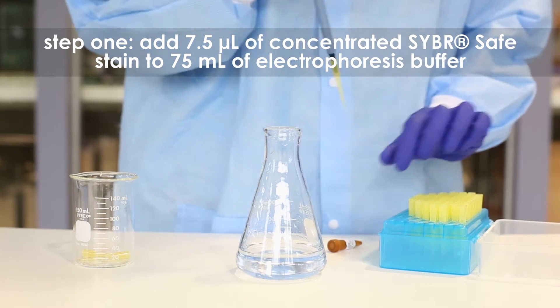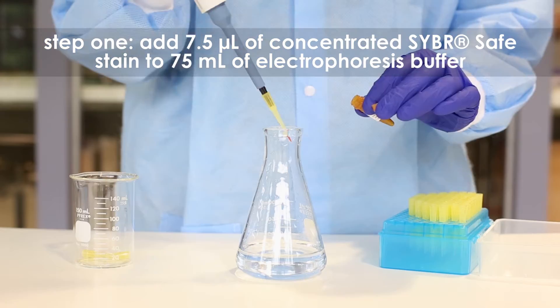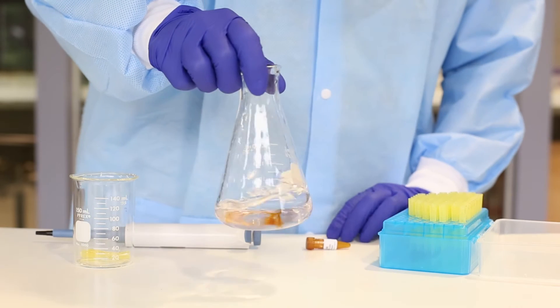Step 1. Dilute the CyberSafe Stain by adding 7.5 microliters of the concentrated stain to 75 ml of electrophoresis buffer in a flask. Mix the solution well.